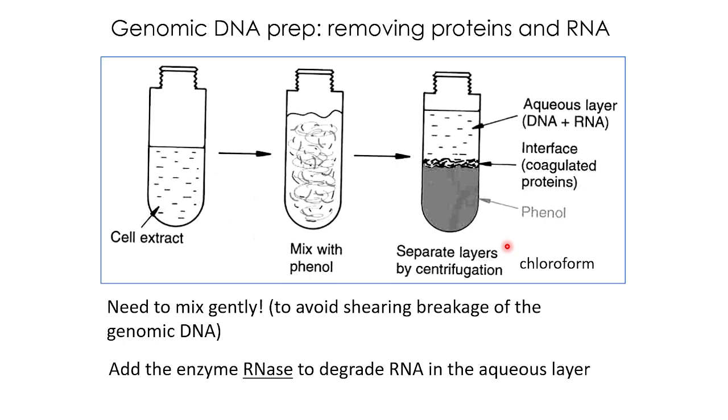You need to gently mix it to avoid shearing breakage of the genomic DNA. Adding the enzyme RNase can help you degrade the RNA in the aqueous layer. So first you get the cell extract, where you would be having your proteins and your RNA.